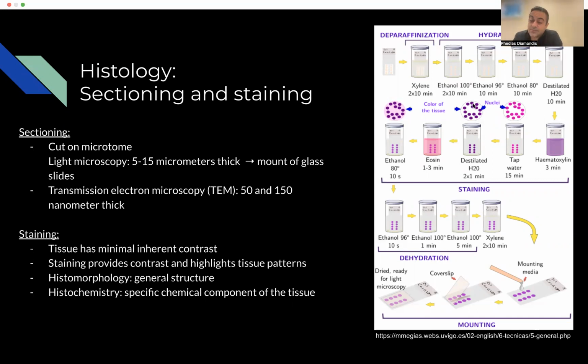At the end, you get these blue nuclei, and you've washed out much of the staining of the cytoplasm, and then you use eosin to stain the cytoplasm pink. This usually stains proteins, which are abundant in the cytoplasm, and then you get this final product, which is blue and pink or purple and pink, depending on how much of that bluization occurs.